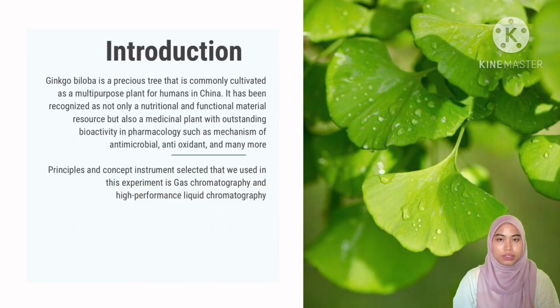Gingko biloba is a precious tree that is commonly cultivated as a multi-purpose plant for humans in China. It has been recognized as not only a nutritional and functional material resource, but also a medicinal plant with outstanding bioactivity in pharmacology, such as antimicrobial and antioxidant mechanisms, and many more. The principal instruments selected that we use in this experiment are gas chromatography and high-performance liquid chromatography.